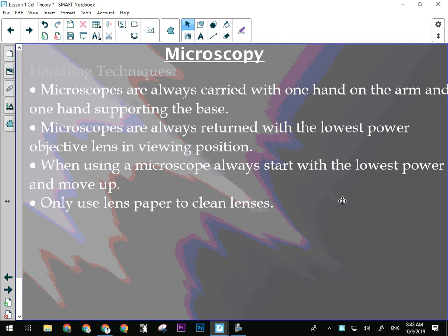And it drags along the ground until somebody steps on it and yanks it out of the back of the microscope. So, please make sure that the power cord is wrapped around it when you're carrying it so that doesn't happen. It's also a way that you could possibly drop the microscope. Okay? So we've got to be careful with these things because they're important and they're expensive.